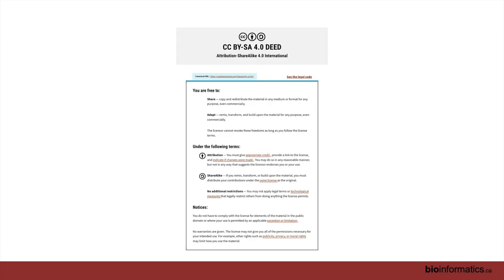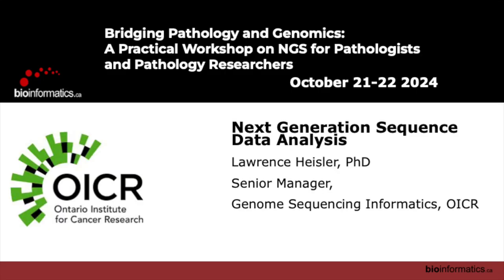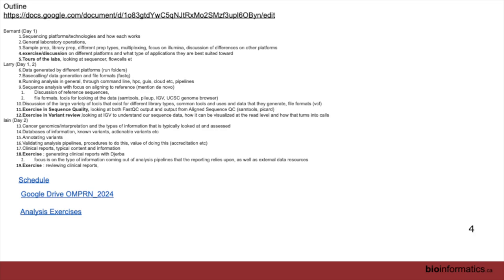I'm going to switch gears now and talk a bit about some of the data that we're generating from the sequencer. And tomorrow, we're just going to start today talking about coming off the sequencer and actually generating some data that we can work with. There's still a few more steps that need to be done. And then I want to end the day by getting a setup for tomorrow's analysis exercises. I'll talk a bit about that.